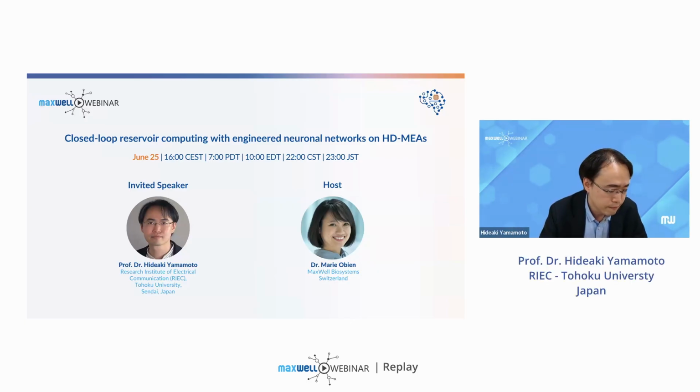Well, for this particular paper that we worked on, Yuki has been culturing the cells for up to 1 month, and it's been stable, especially with the flatter MaxOne Plus chip that Marie described in the first half of this webinar. So at least 1 month they work. I don't really have the number beyond that, but I think there are many more people working, especially in human cells, that are doing longer term cultures.